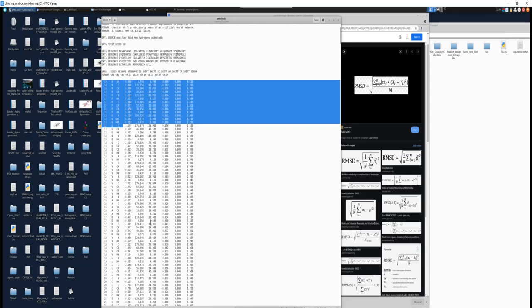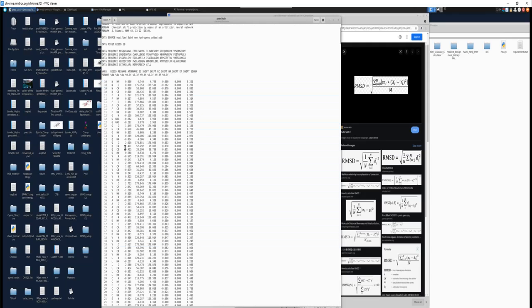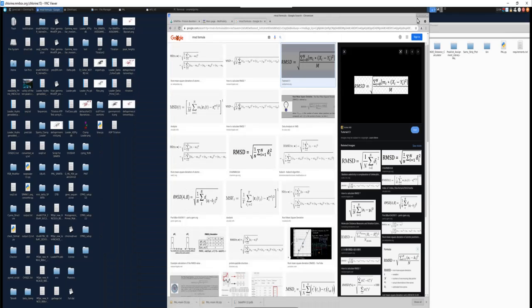So you're going to go through this entire table and, in pairs of 6, calculate the RMSD of your predicted. So if this doesn't make sense, don't worry. I'll actually go through how to use this tool, but this is the math that's going on underneath the program that I have written.